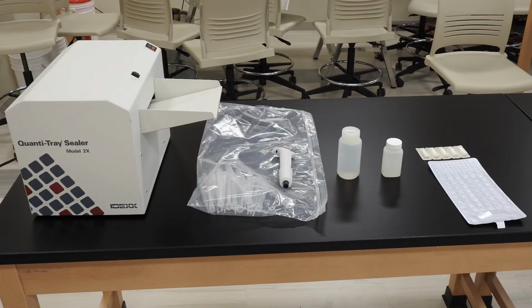Shown here is the equipment that we use to analyze bacteria for a Stream Team. We have sample water, but we also have ultra-pure water that has been sterilized beforehand. We also have a powder reagent, a quanti tray, which we will put the sample in, and then a sealer, which will seal the quanti tray to allow the bacteria to incubate for 24 hours.